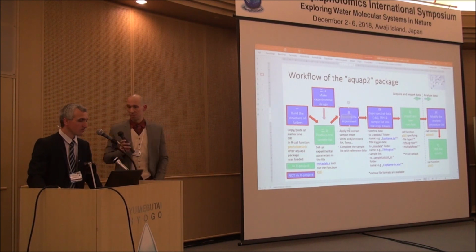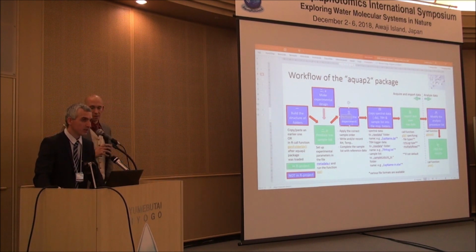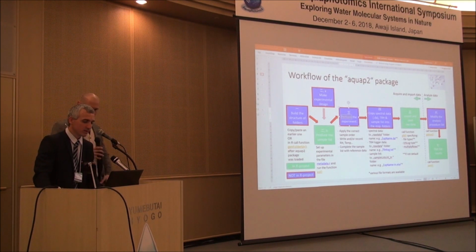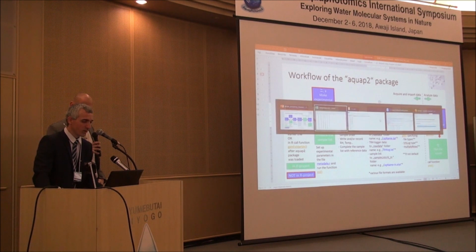Yes, and right after you did the experiment, you can analyze your data within basically a few seconds, not in details of course, but with this automated software. What you need to do only is copy the files into the correct folders. So what does it mean?